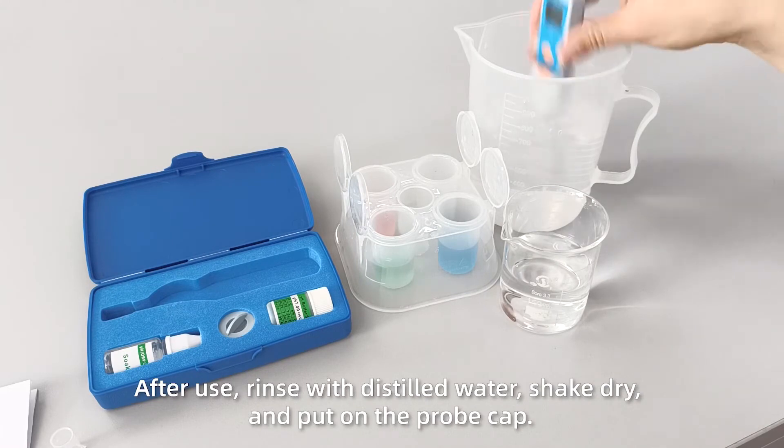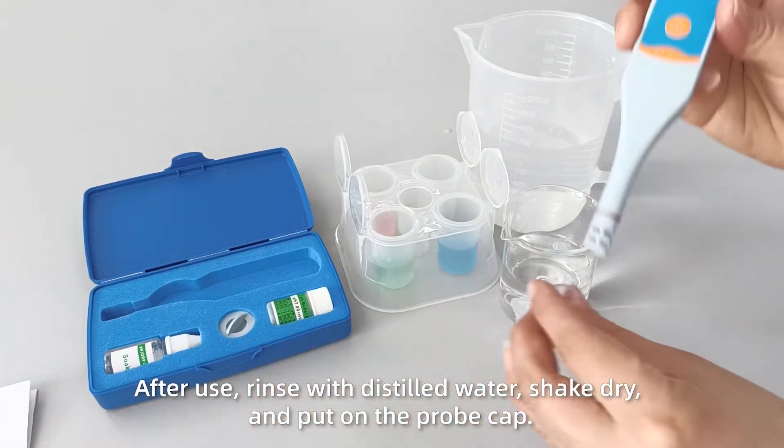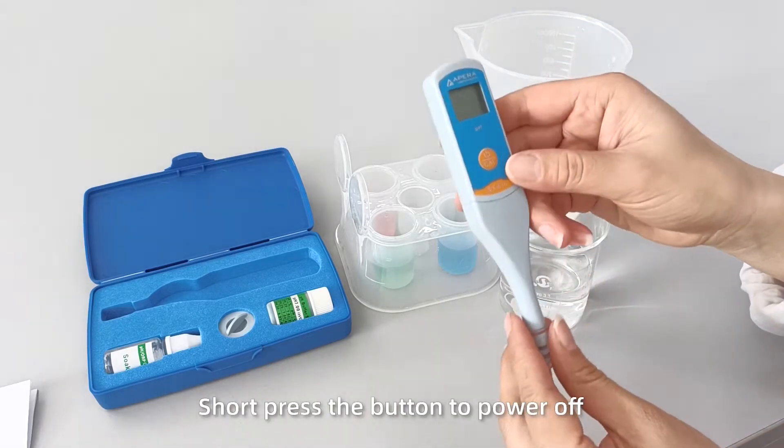After use, rinse with distilled water, shake dry, and put on the probe cap.